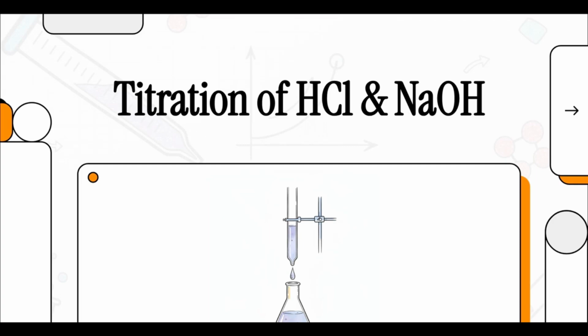Today we're decoding one of the most fundamental and, let's be honest, sometimes pretty tricky practical skills in Edexcel A-Level chemistry. We're talking about the classic acid-base titration. Specifically, we'll be breaking down the reaction between hydrochloric acid and sodium hydroxide using phenolphthalein. So let's figure out how to structure our understanding and secure those top exam marks together.